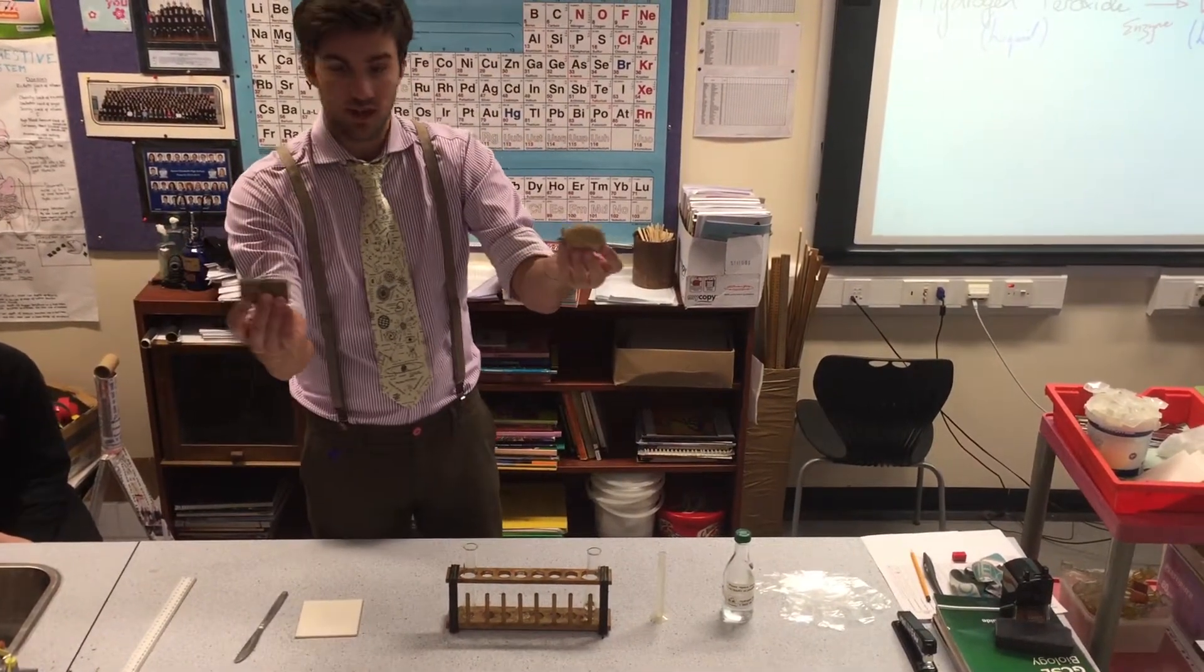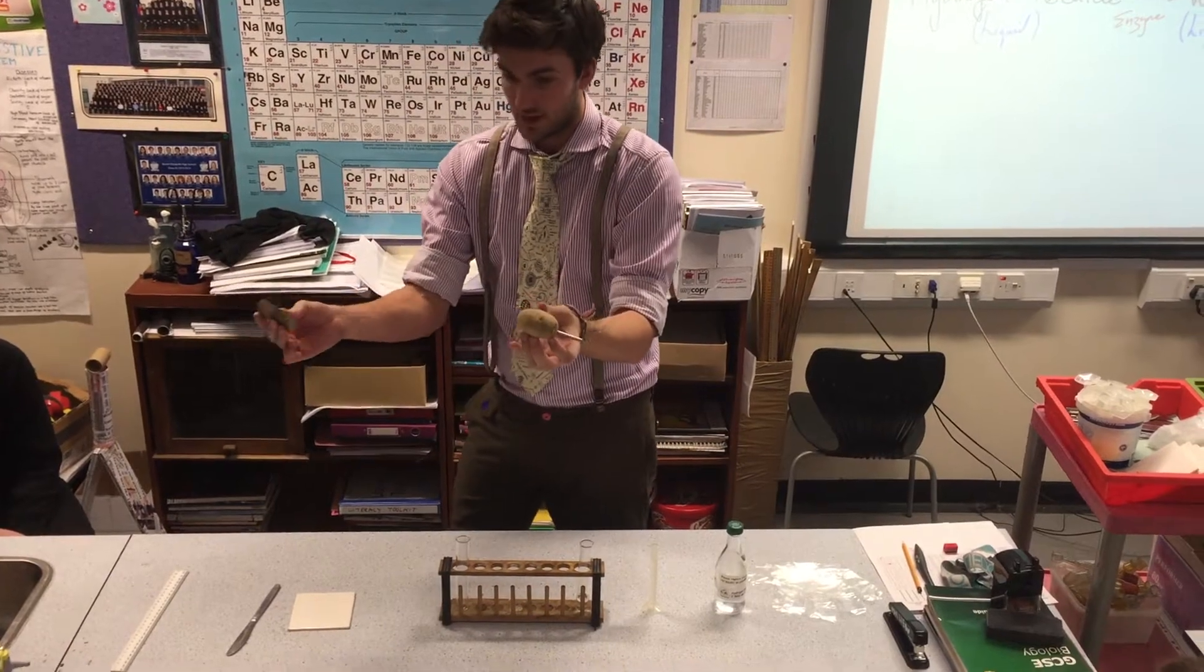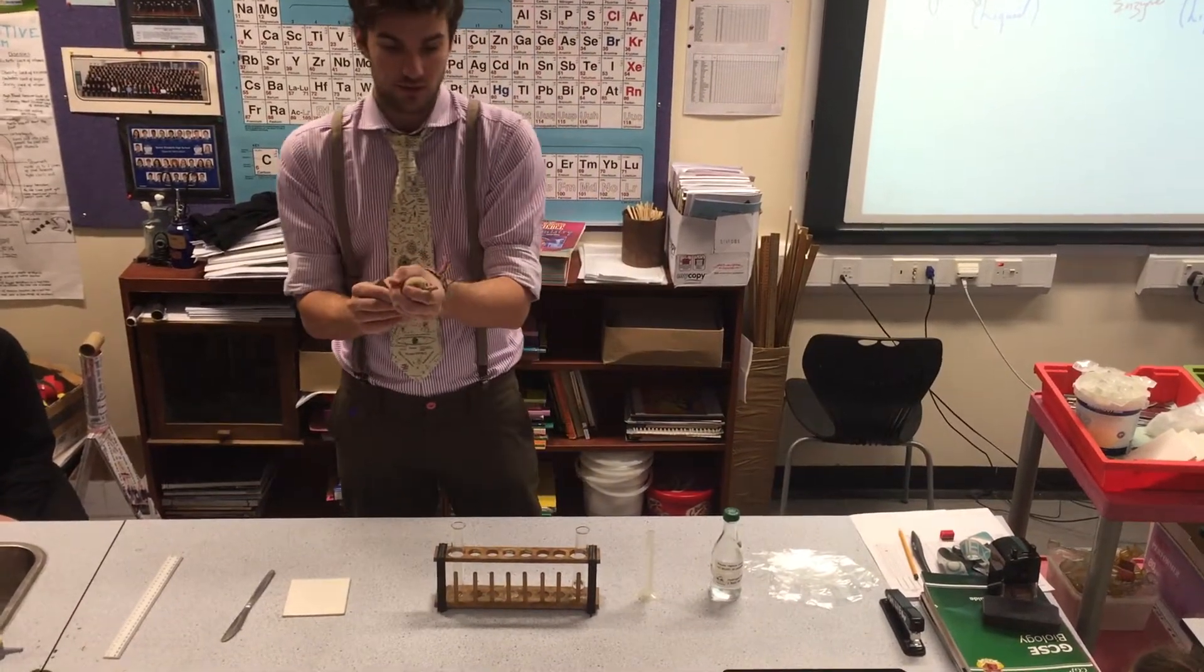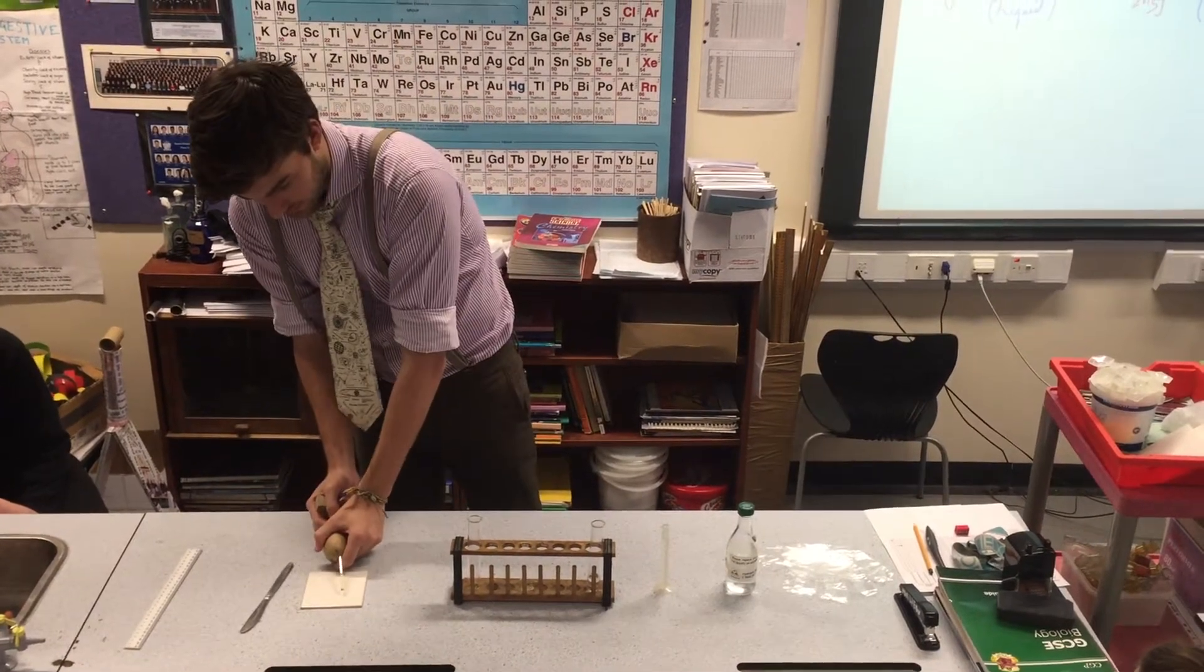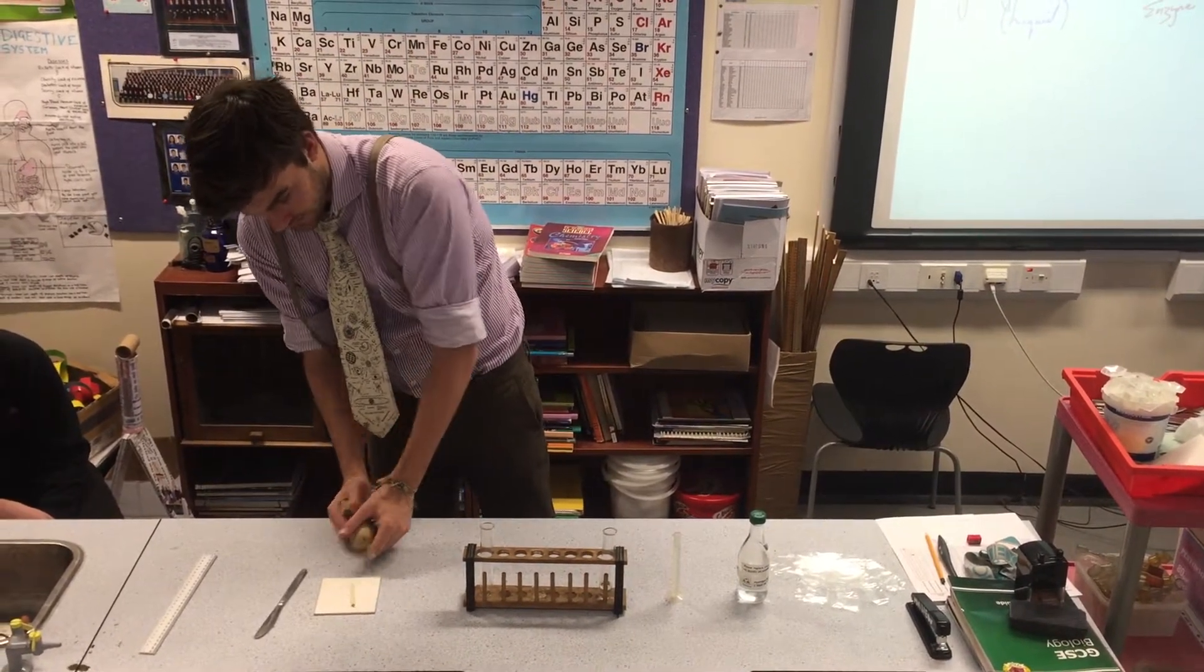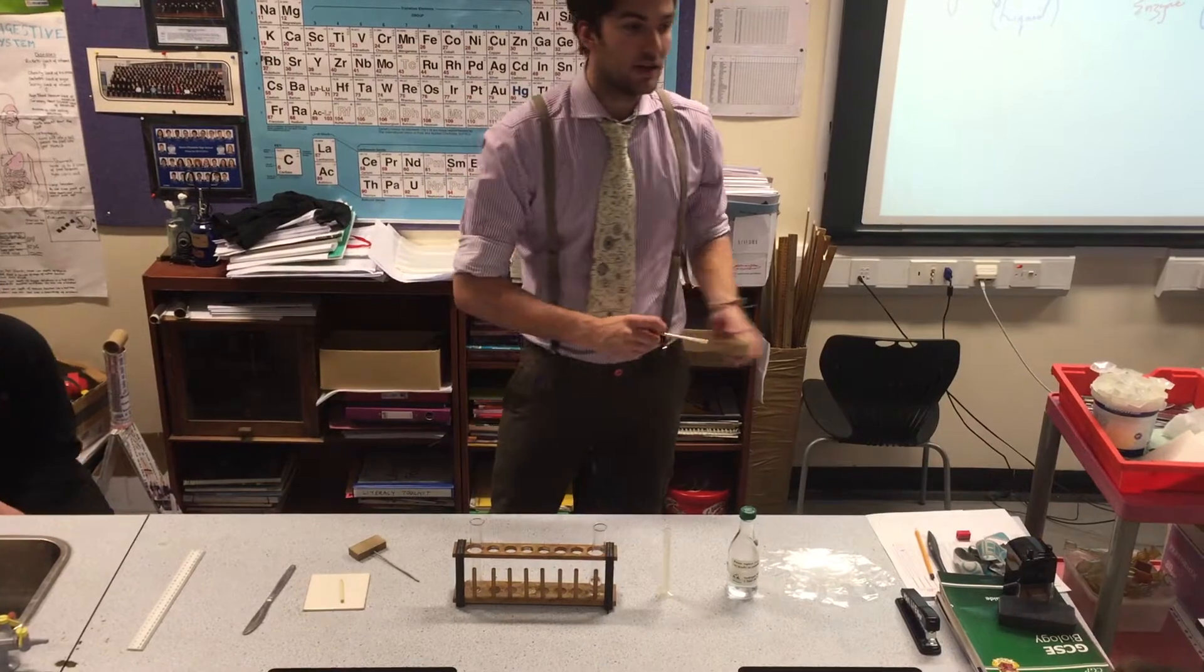What you need to do then, is with this end, what do you think you do? You push out the potato. See what's happening? Oh! That's cool. So there's one length of potato.